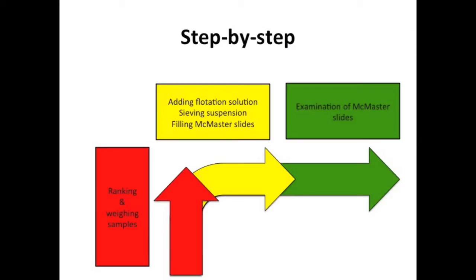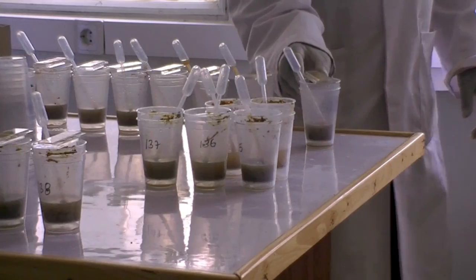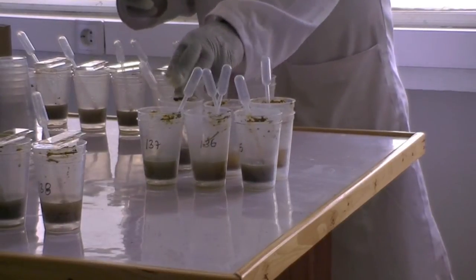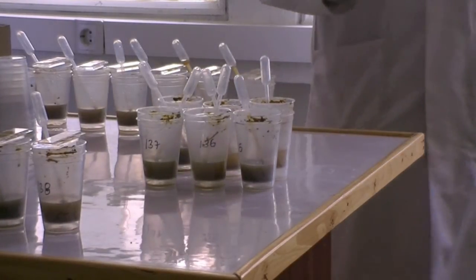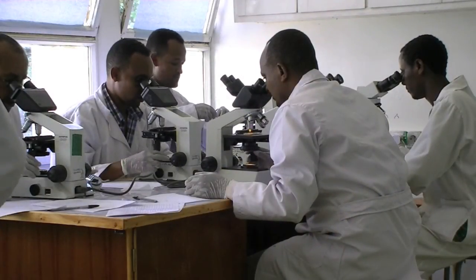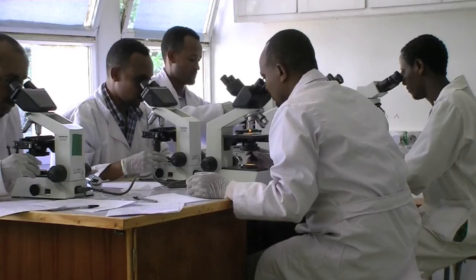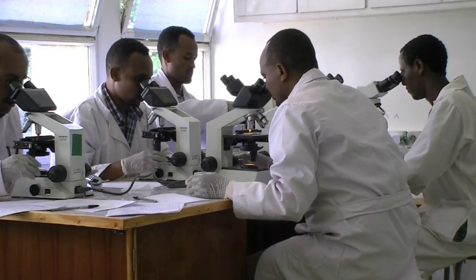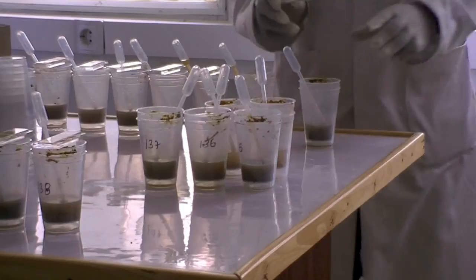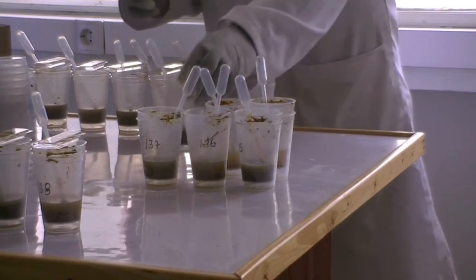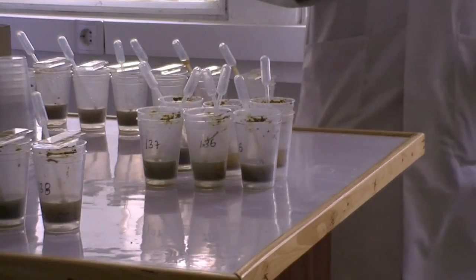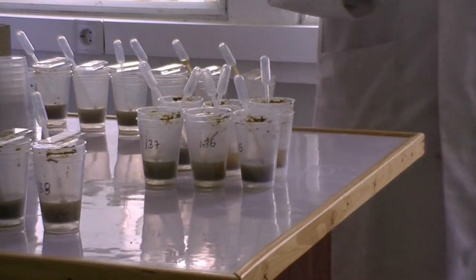Step 3: Examining the McMaster slides. It is important to start with the sample most closely to the edge of the table, as this sample was processed first and hence the eggs will have had sufficient time to float against the surface of the slide. To clearly indicate which slides have already been examined, it is recommended to put the beakers in the middle of the table, taking into account the order of the samples.